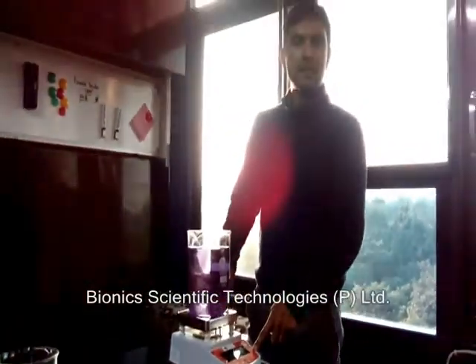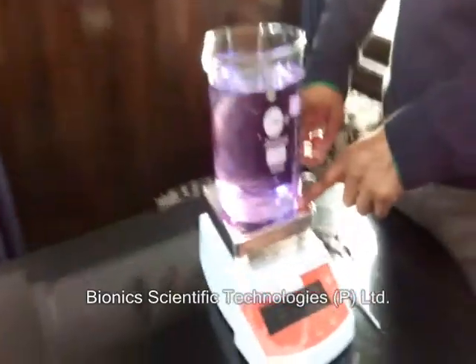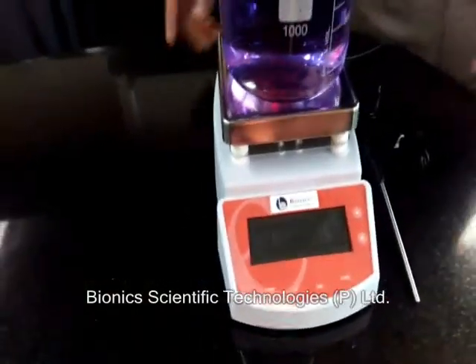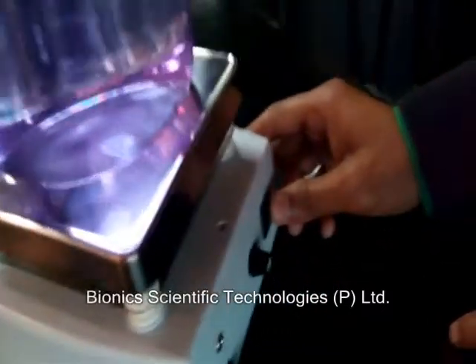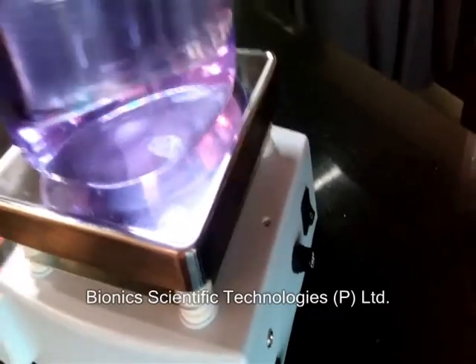This is a hot plate with magnetic stirrer, completely made up of stainless steel 304 on the upper part; the rest of the body is made up of plastic. We can start the machine by pushing the on button, which is behind. You can see this is the on/off button, this is the fuse, and this is the sensor.